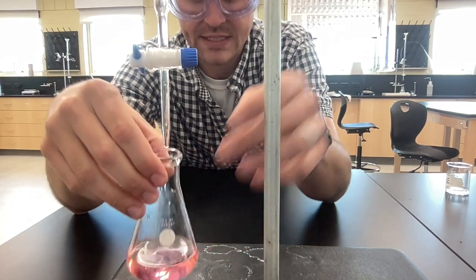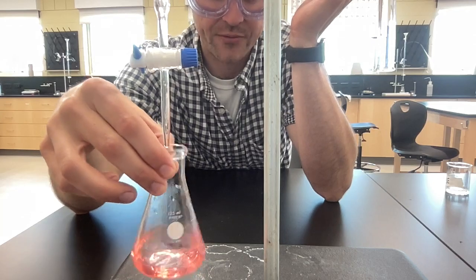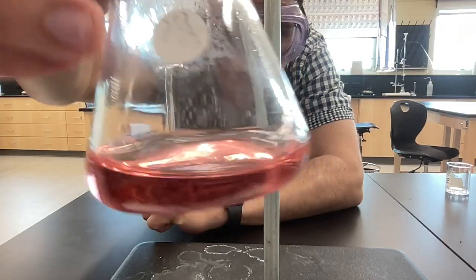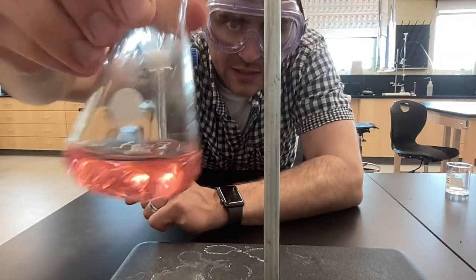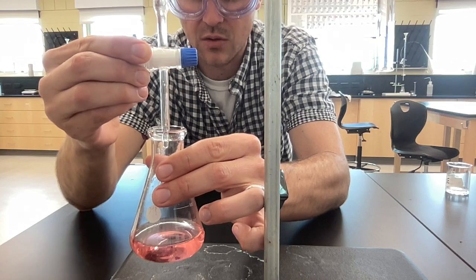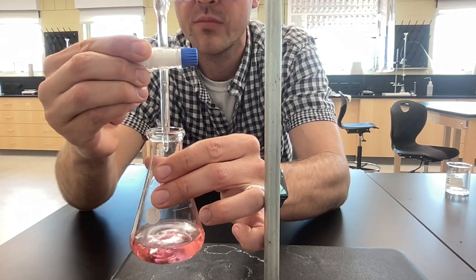19 and a half, oh, maybe 19 and a half is it. It's close, you can almost see it. It's like half purple and half red. It's kind of cool. But let's go right to 20. Let's see what happens. Another half milliliter or so, a little drip by drip by drip.